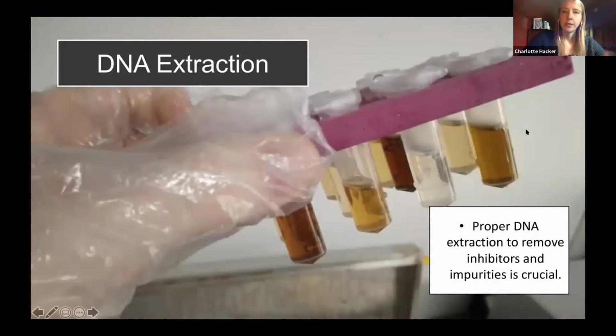DNA extraction, once you have your actual sample and you get it to the lab, you've collected it, you're going to extract the DNA through a process called DNA extraction. And that's generally done with a commercial kit. Imogene showed a little bit of that. It's a series of different washing steps. And basically the result that you're going to get is the DNA that you're ultimately going to work with for your genotyping or whatever other analyses you're going to be doing with that DNA.